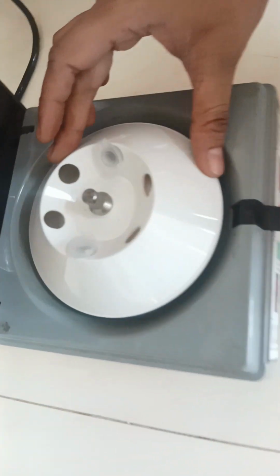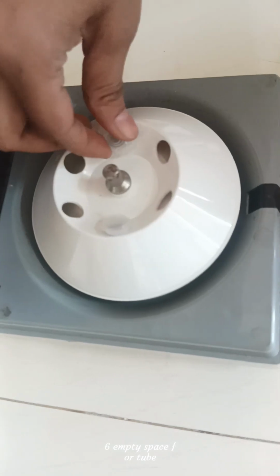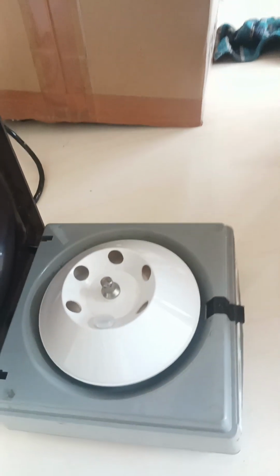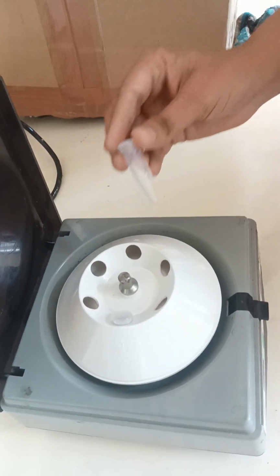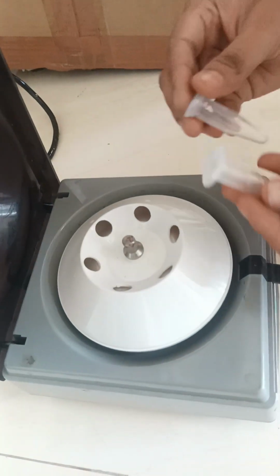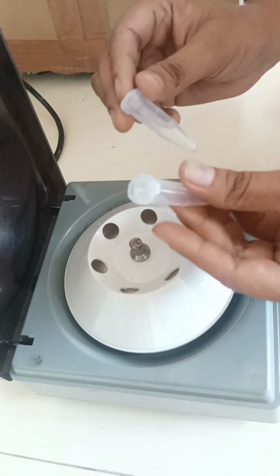Internally you can see there are 1, 2, 3, 4, 5, 6 empty spaces where you can put your Eppendorf tube. These are the only tubes which can go in this kind of centrifuge. The capacity of this Eppendorf is 1.5 ml. Whenever you are putting any tube with a sample into the centrifuge, make sure that the centrifuge is balanced. If your sample is in one tube, in the other tube you can put water of the same volume.